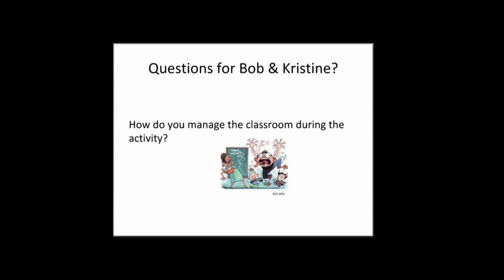I did want to give an example, touching base back on the forensics lab. It was a classroom of about 32 students, and only about 7 students ran the instrument, so we created handouts for the instructor to hand out to their students so they could read up on the activity, and then it had spots for the students to draw the samples or draw what they saw, make notes, and so that really allowed them to be engaged and helped with management of the classroom, so everyone felt like they were involved. Does that answer your question?